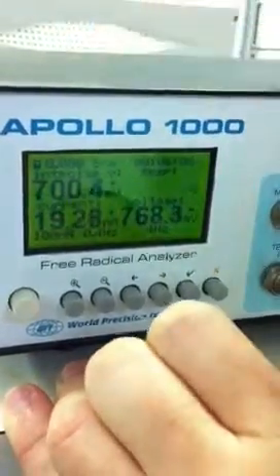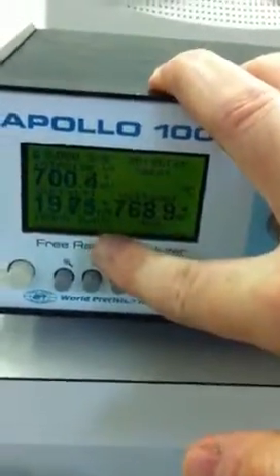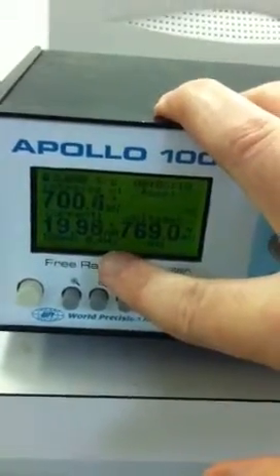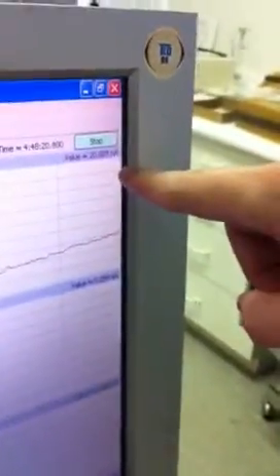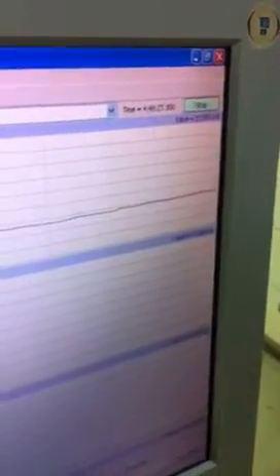And we're operating again in the 100 nanoamp range. And as you can see with the LabTrax system, our value on the Apollo 1000 is about 19.5 nanoamps. Close to 20. And here, if you look at the channel, we are also close to 20. Just a little bit, which is this baseline here. And now we're looking at roughly a minute and a half worth of data.